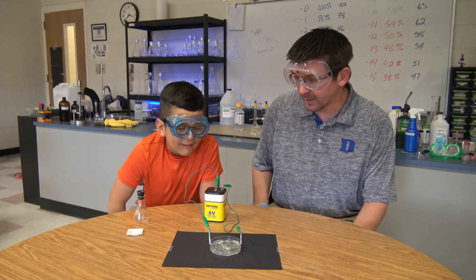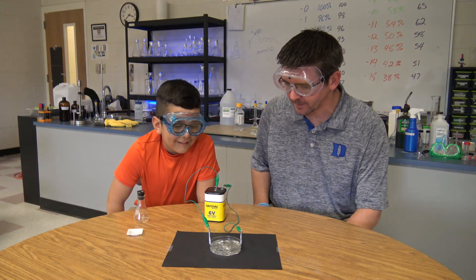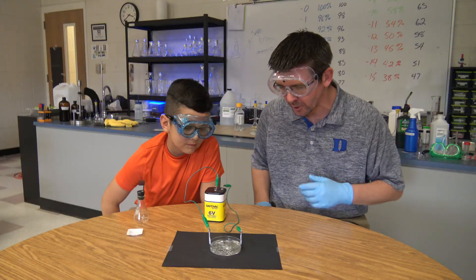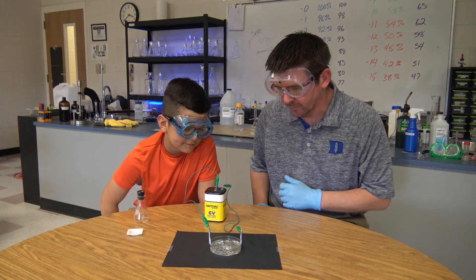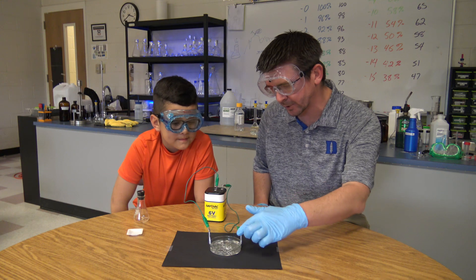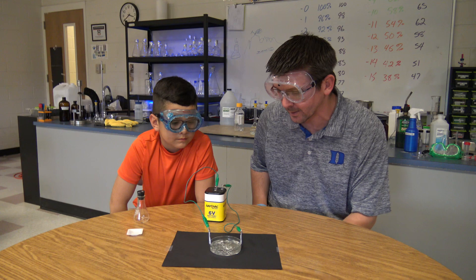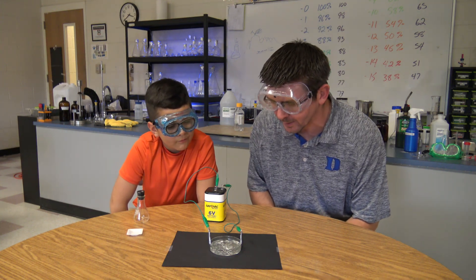Well Hunter, it's been about five minutes now, and it definitely looks like a chemical change has taken place inside our petri dish. You see all the metallic material in there? That is actually metal — that's tin that formed out of that tin(2) chloride solution through the electrical current passing. As it formed, this is where our negative end of the battery is connected, and the electrons are flowing out the negative end through there. As the current goes into the liquid, that's going to start forming the crystals on the negative end, all the way over connecting eventually to the positive end, and really fill in the whole bottom of the petri dish with the metal that's being formed out of that solution.